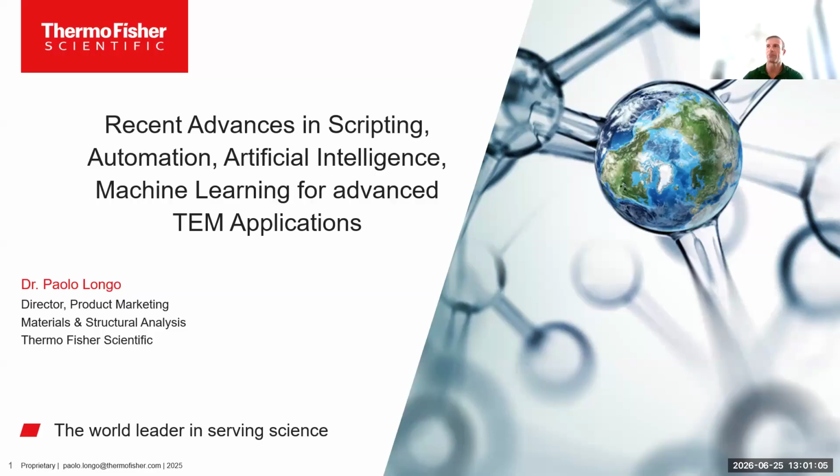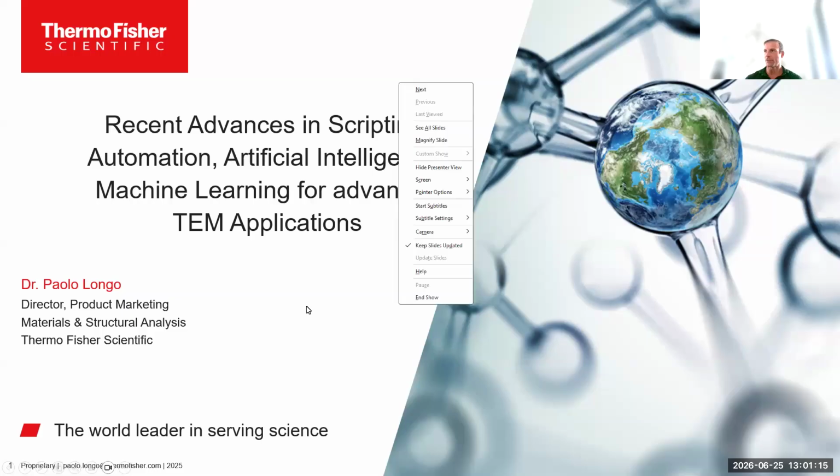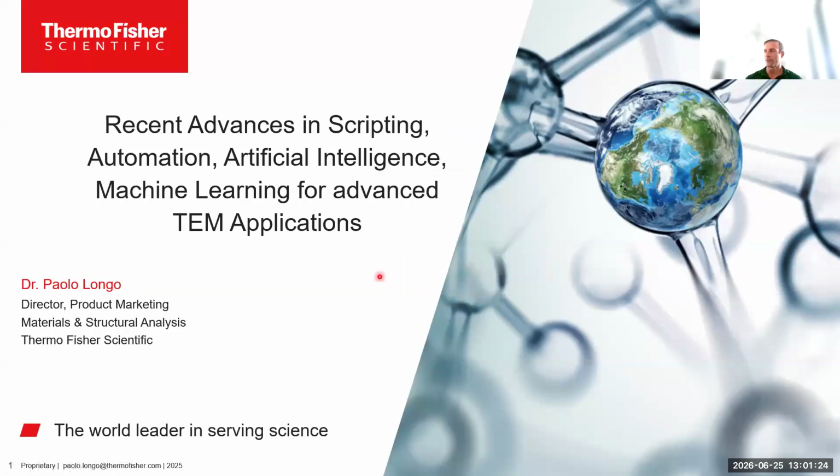ThermoFisher microscope. So basically, in this presentation, we're going to talk about scripting, automation, and essentially how we could get some machine learning and AI for advanced TEM application. I'm sure you're going to have a lot of hands-on, a lot of practice. So this is going to be a little bit the foundations.